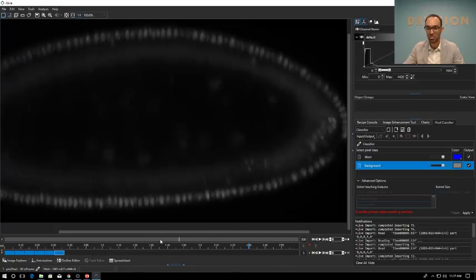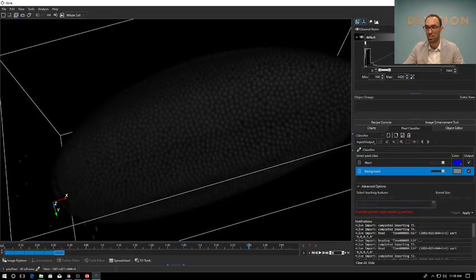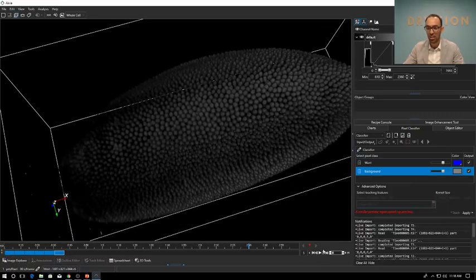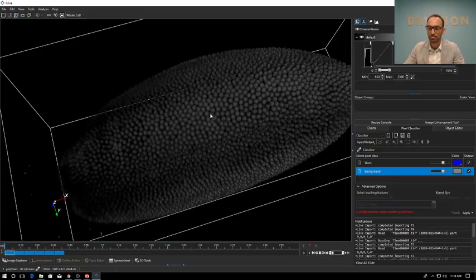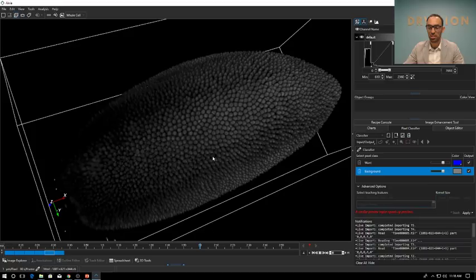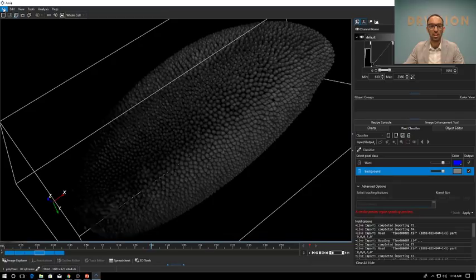So you can investigate the image in 2D, you can go into 3D, and all of the time the software Aivia is actively fetching new files and loading them on. So now it has finished that time lapse of 1, 2, 3, 4, 5, 6 time points, and you can play through it and have a look at it. You can start to do image analysis on it if you want. If you have a dual view microscope, like a light sheet microscope, there is an option, and I should show that at the beginning here.